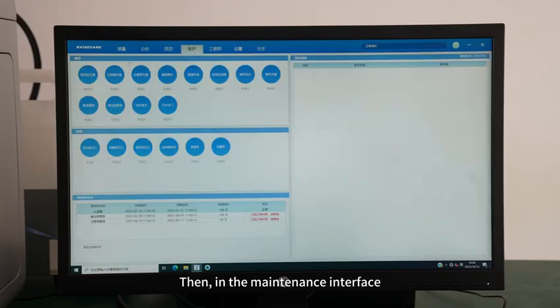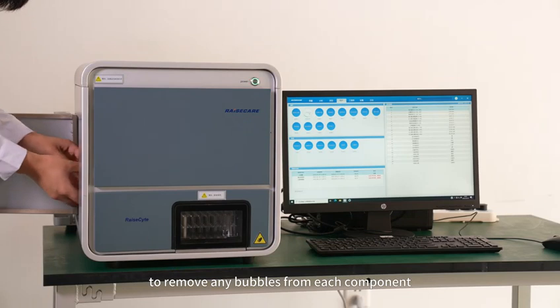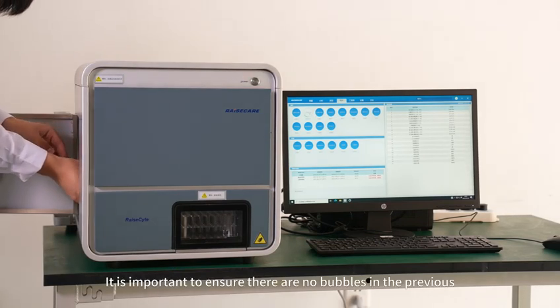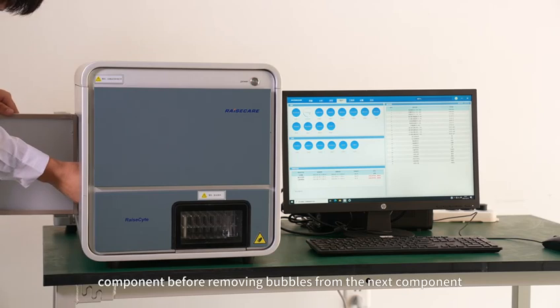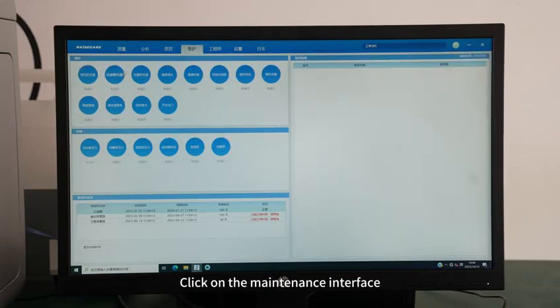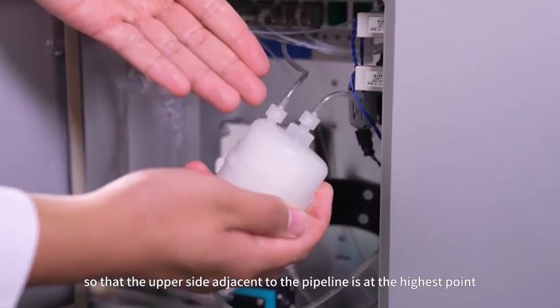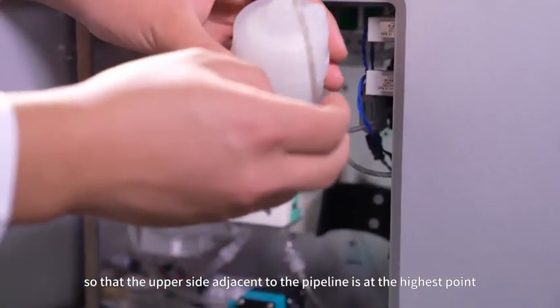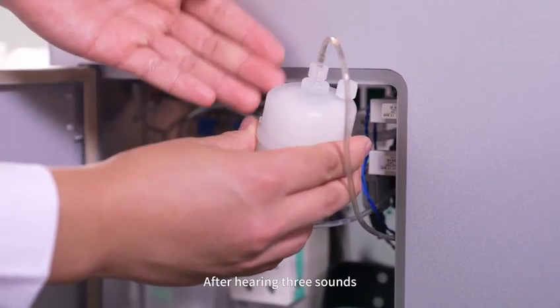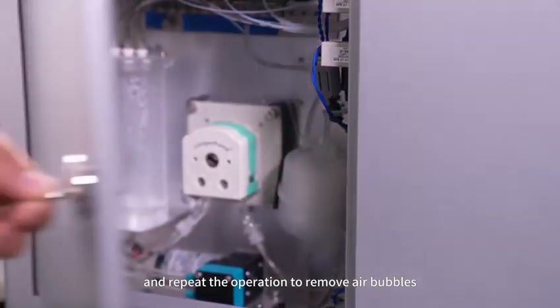Then, in the maintenance interface, click on the filter, plunger pump, and the rectifier chamber in sequence to remove any bubbles from each component. It is important to ensure that there are no bubbles in the previous component before removing bubbles from the next component. First, filter. Click on the maintenance interface and select Fill Filter to tilt the filter so that the upper side adjacent to the pipeline is at the highest point. After hearing 3 sounds, invert the filter and repeat the operation to remove air bubbles.